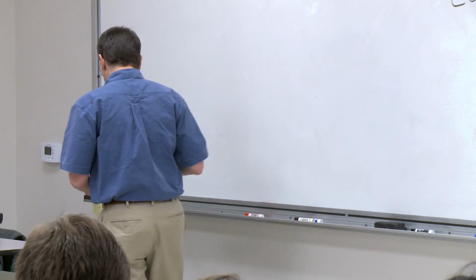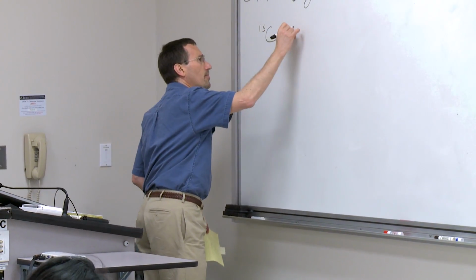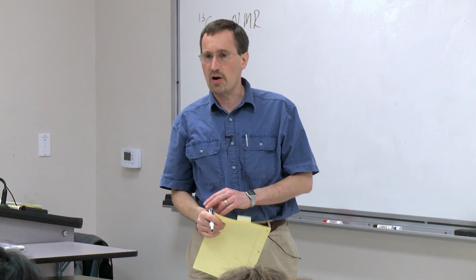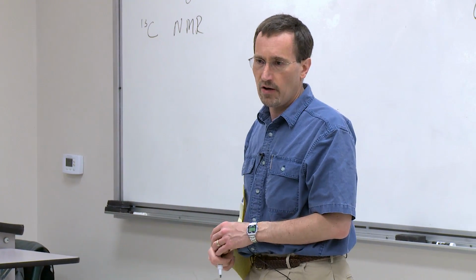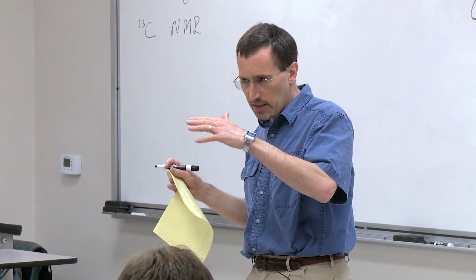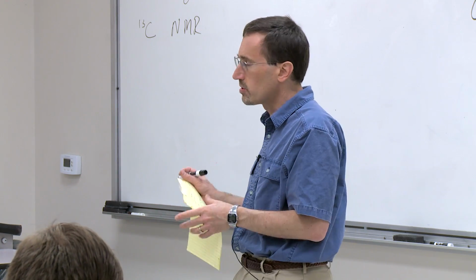So C13 NMR is sort of an impossible technique. We already talked about proton NMR, and I said, well, there are really tiny energy differences involved. You've got a very small difference in Boltzmann distribution, and all of that is true, which gives you very low sensitivity, so you need very good instrumentation.